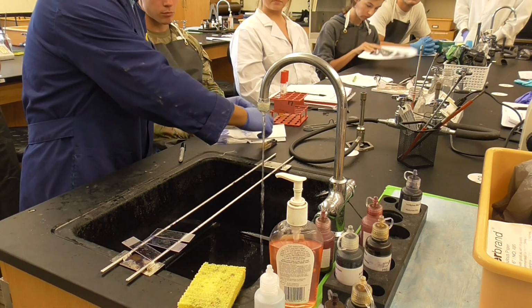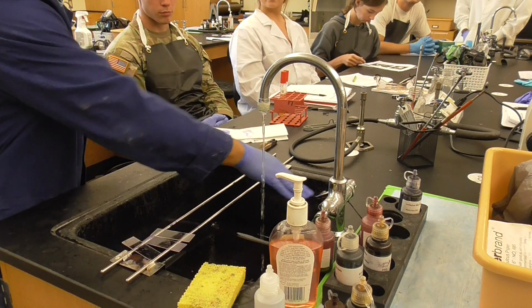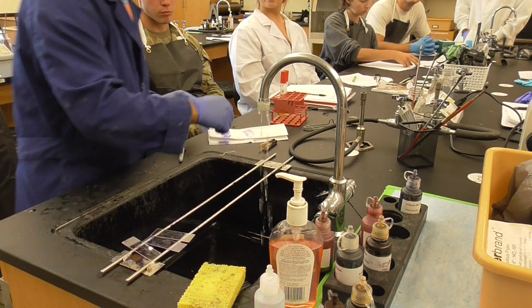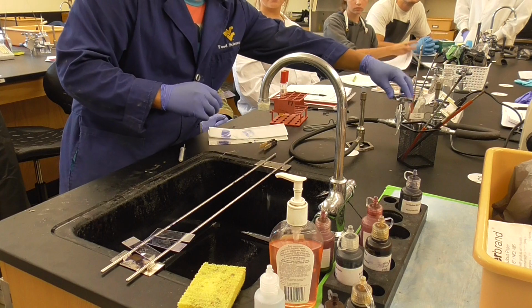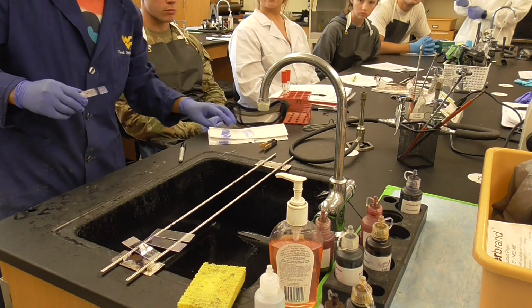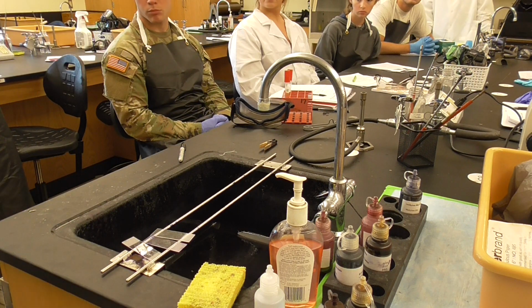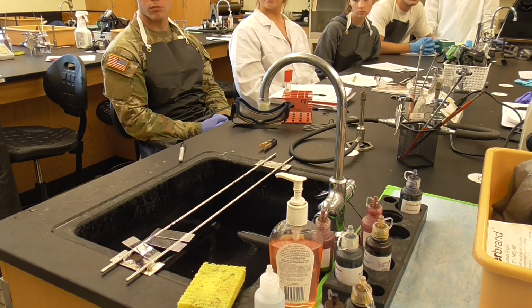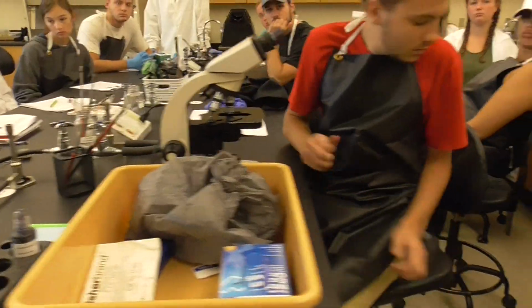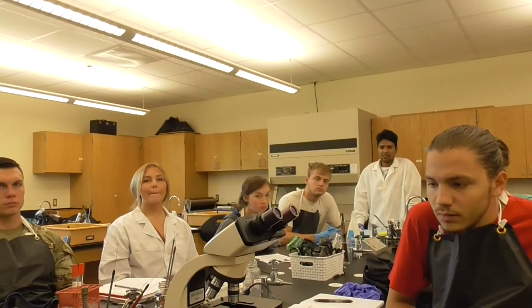Okay, then let's see whether we can find something underneath the microscope. And at this time, this you can turn it off. Okay, now we don't need a goggle at all. This is a biohazard. Remember, if you have a dye there, this is a biohazard, so go here. Okay, now I'm going to show you again how to use the microscope. We'll see whether we can find something, okay?